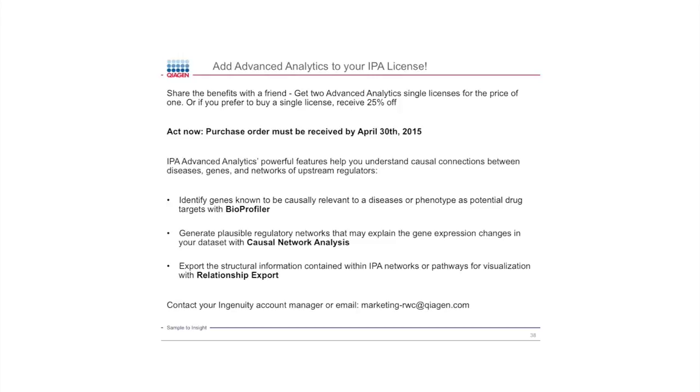Thank you, Stuart. We have some questions here. Would IPA use the KEGG database for metabolic pathways again in the near future? Not in the near future. KEGG is still available as gene lists in IPA, but the pathways themselves are not part of IPA.